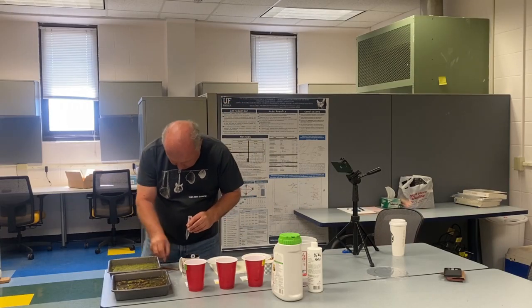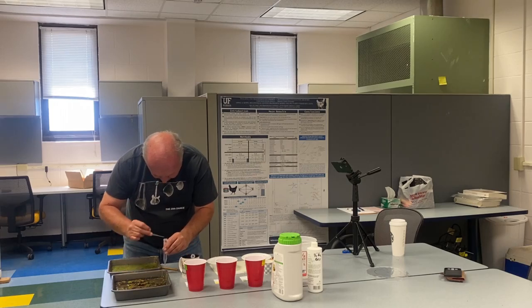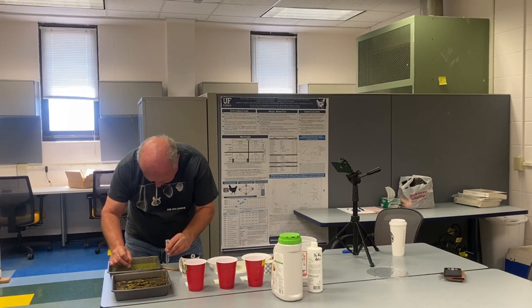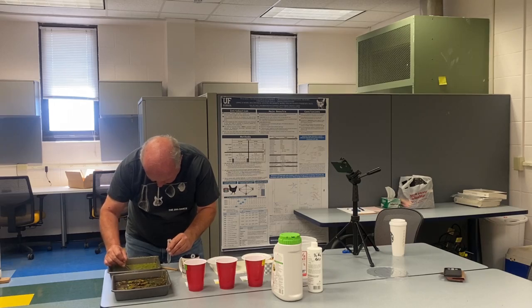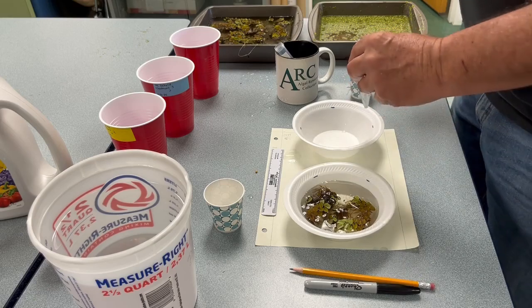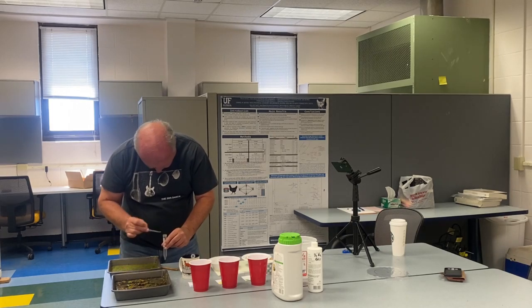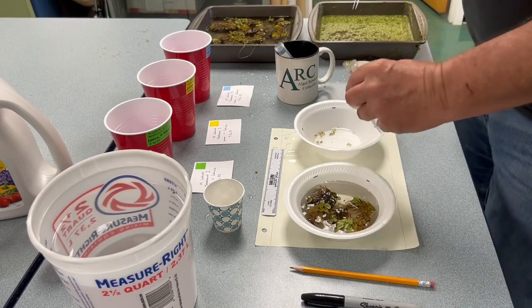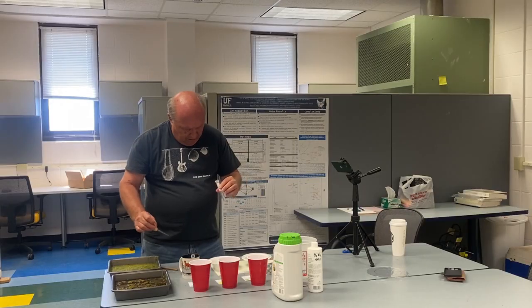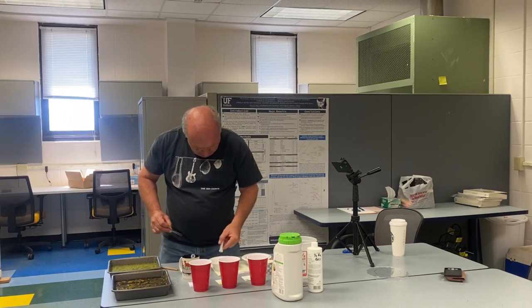Okay, this one's a little trickier. And so you're basically picking these off with hopefully some tweezers or some chopsticks or whatever. It's best if you don't use your fingers on this because they're a little bit too small to really control the way you want to do this. Okay, this is one. Here's another one. Put that in there. And the Lemnas tend to stick to the walls of the things, so you got to make sure you get all of them. Okay.